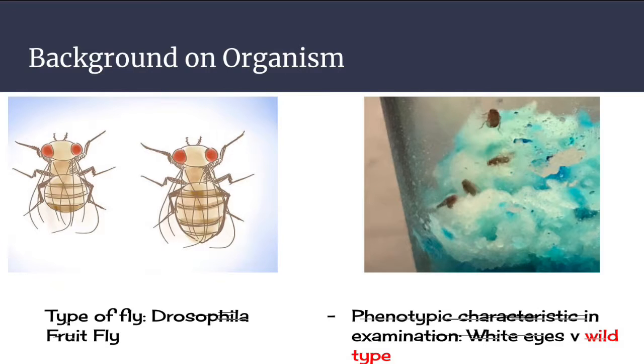We also use primarily pregnant females for the first generation to allow us to get guaranteed larvae for the next generation. Throughout this project, we might see an ongoing competition between white-eye and wild-type flies, primarily due to the fact that these two phenotypes are going to be the main phenotypes we see during the project. There could also be possibilities of incomplete dominance or codominance.